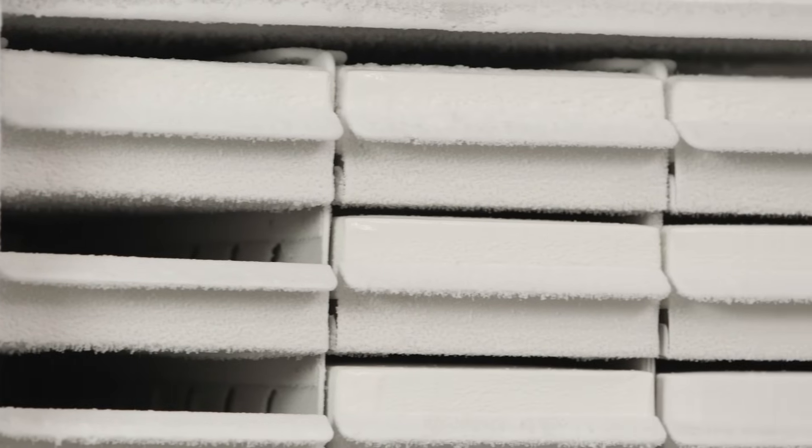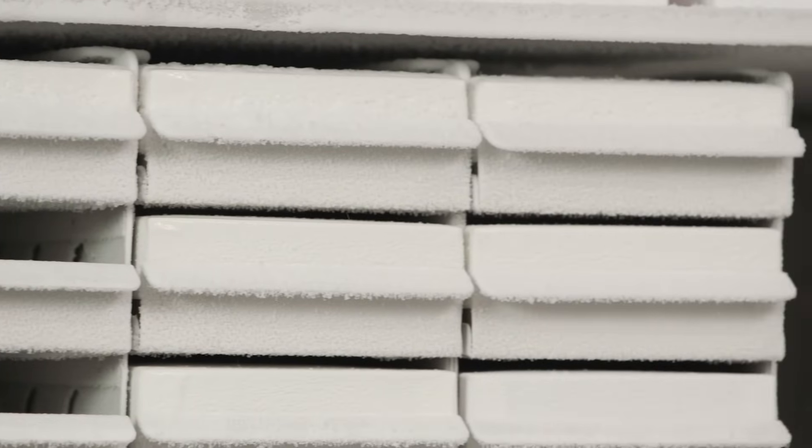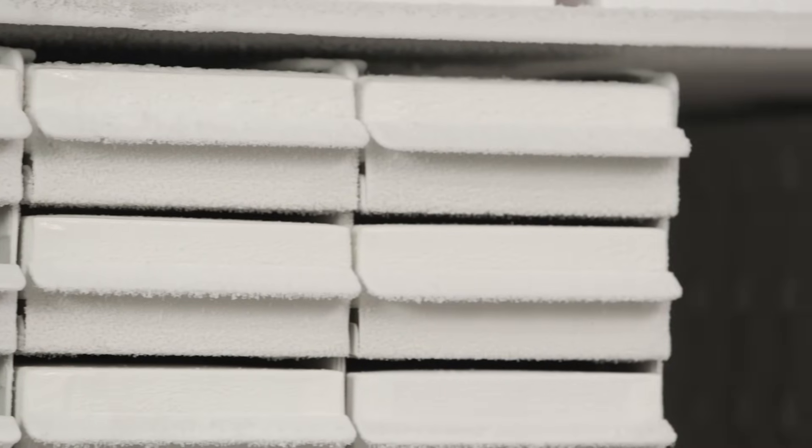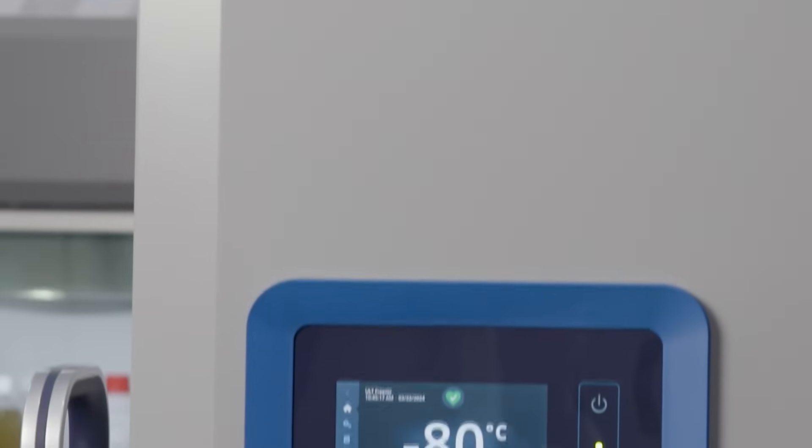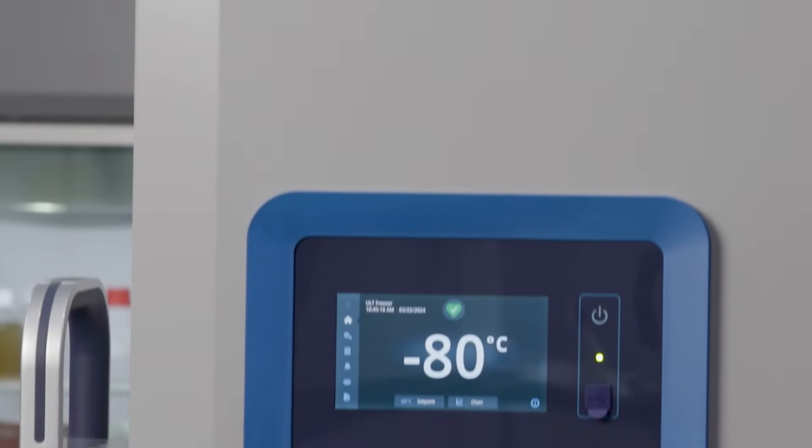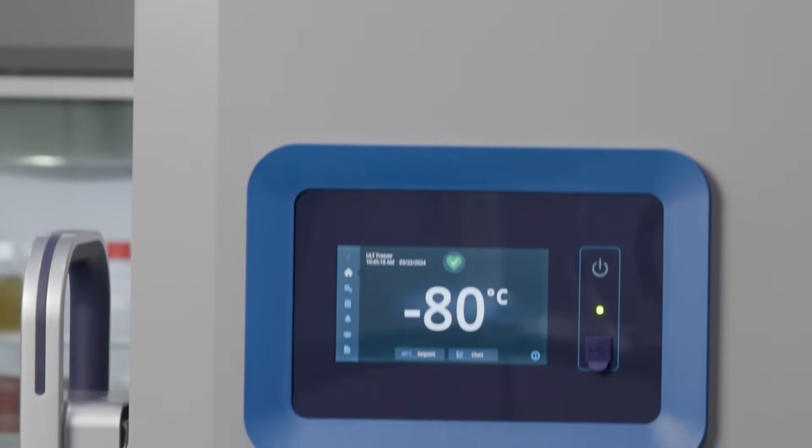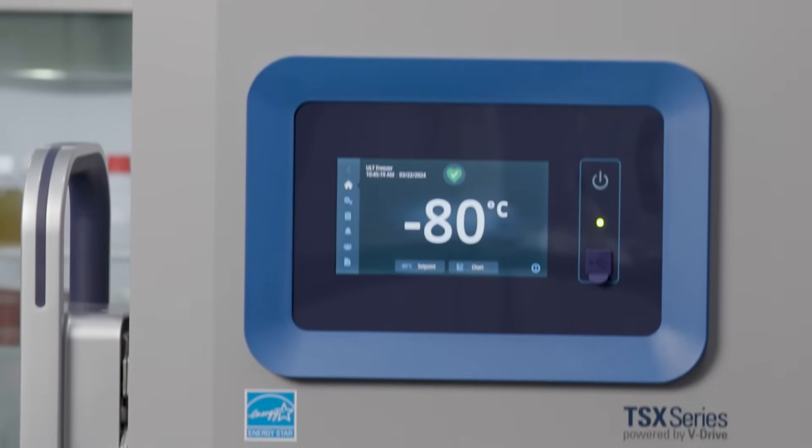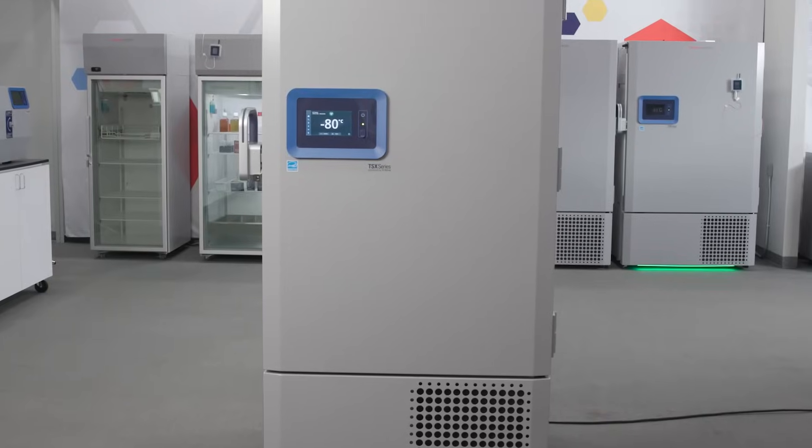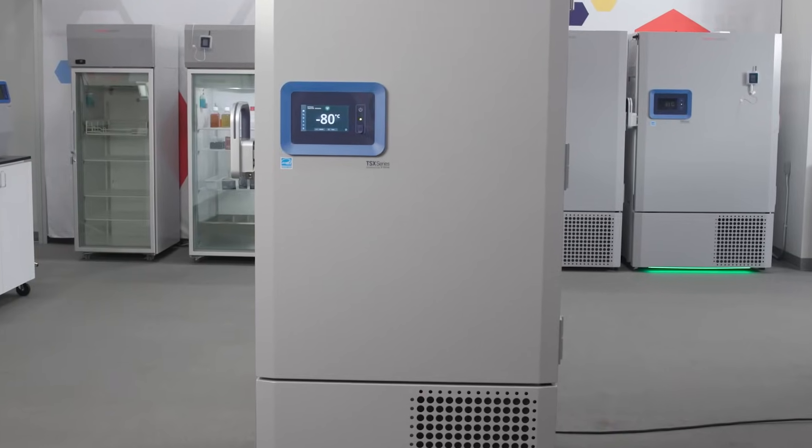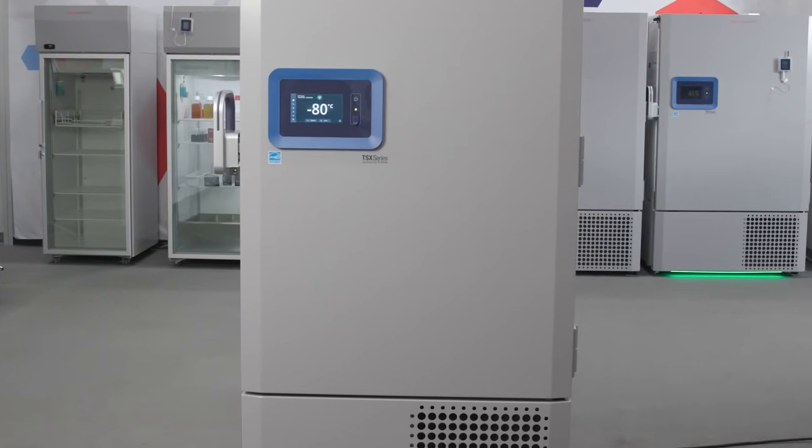Sample security is critical. While we operate only during a portion of the day, cold storage units run 24-7. Adding monitoring to your ULT Freezer helps provide peace of mind anytime, anywhere. The TSX Universal ULT Freezer makes that job even easier.